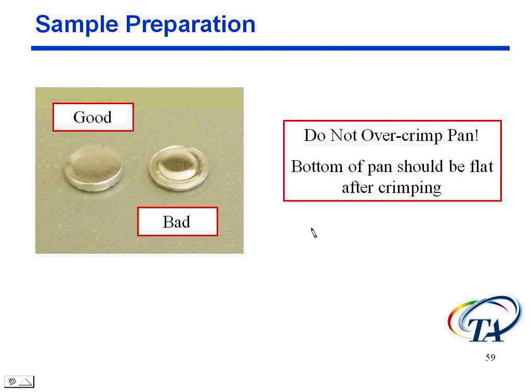Just start. And so let me just make a crude drawing here, but if you have the lid like this and the pan like this, you want that pan just to be over so it holds that lid in place. You don't want to smash it a lot so that it flattens it and it makes the bottom be kind of ugly like this. Okay?